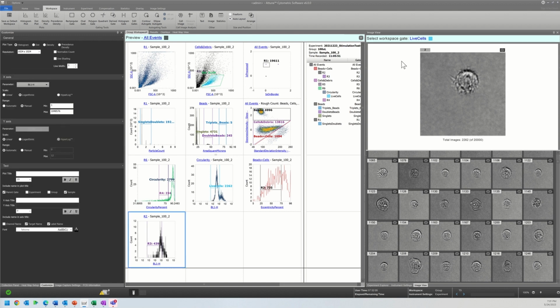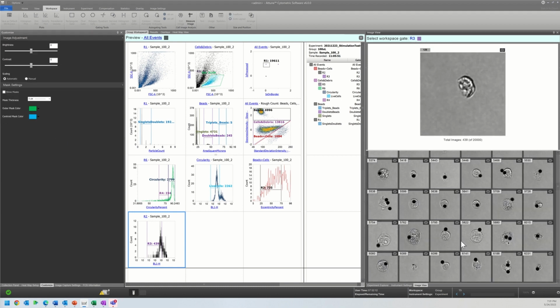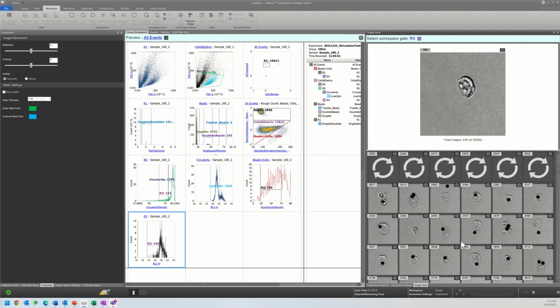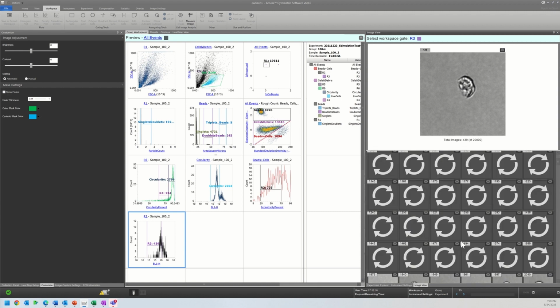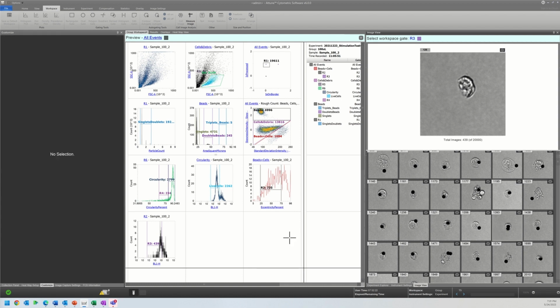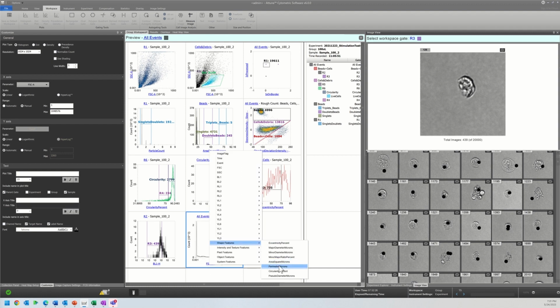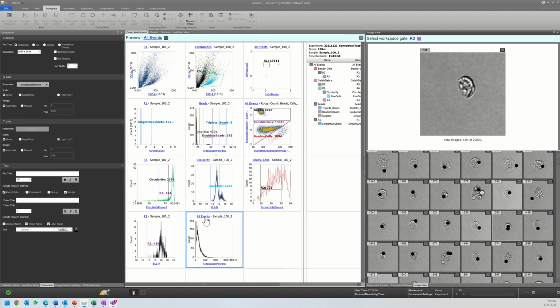We've got about 400 cells that are still attached to beads. And we can refine this further using some of the other parameters such as area. We can eliminate some of these really small events and ultimately keep on going to get a more exact count. At this point, around 400 is exact enough for the work that I do.